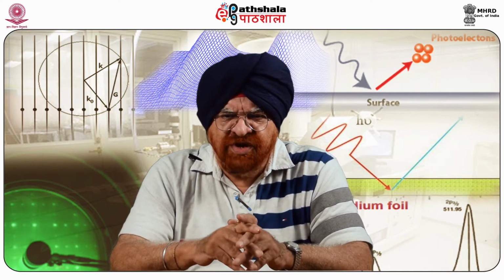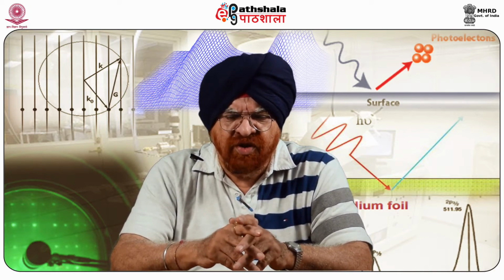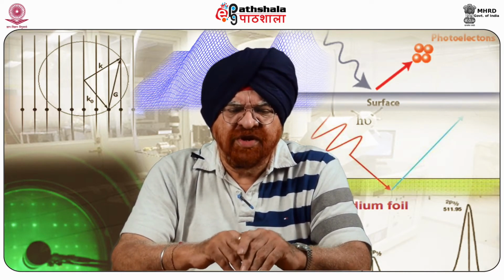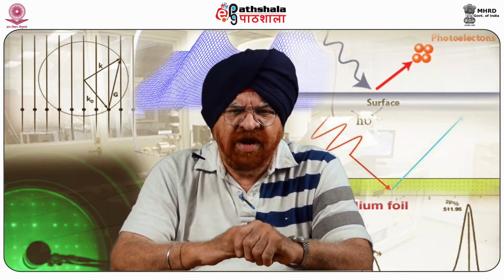Study of oxide surface layers on metals and alloys can also be precisely measured with the help of this. Determination of surface contaminants on semiconductors is another great help that this equipment is able to render, and this goes a long way in the area of semiconductor research.